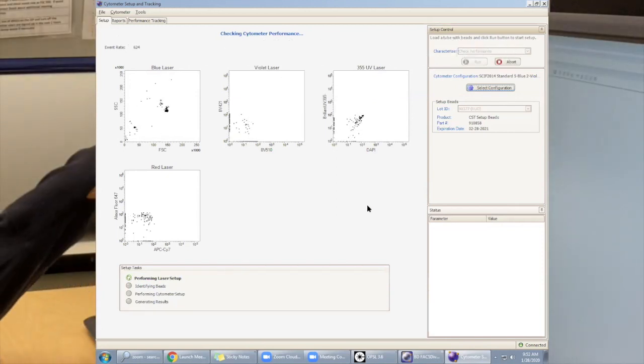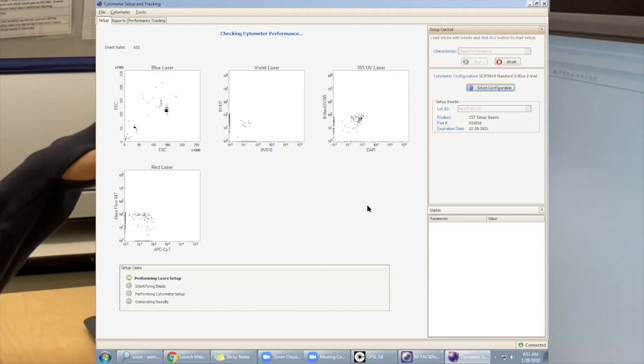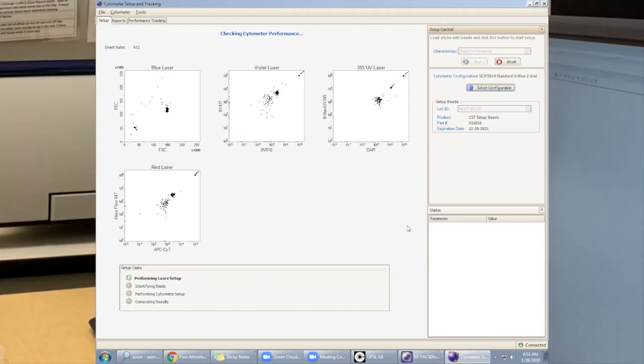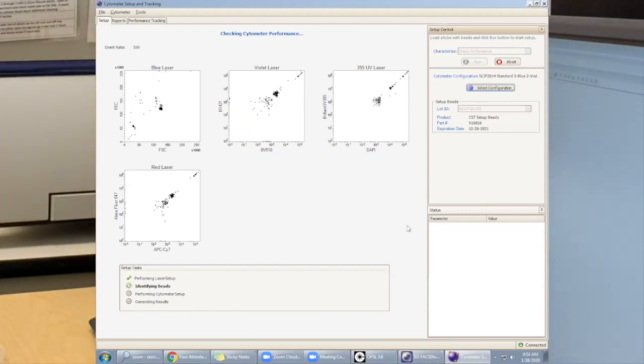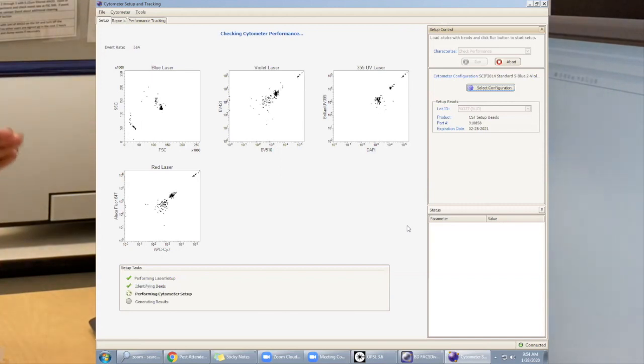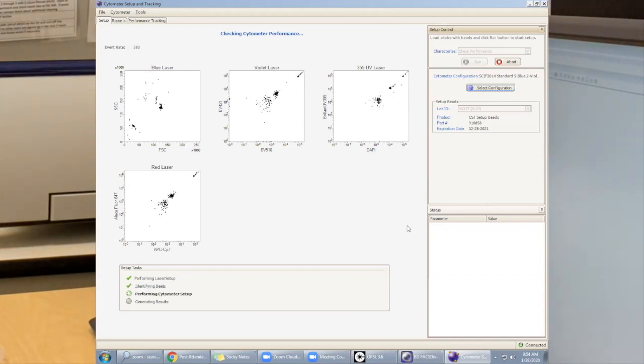This is what a normal CST should look like. The machine has just found the beads and it's going to go over the set of tasks until it is done with the results.